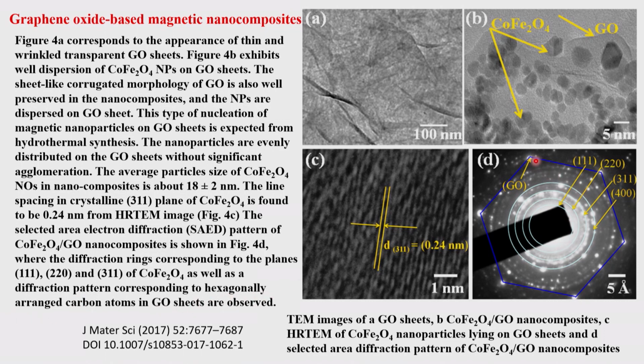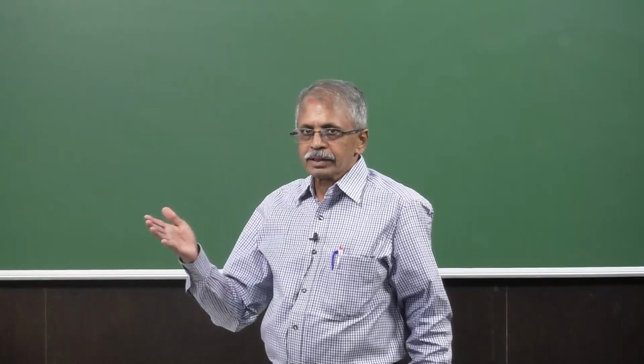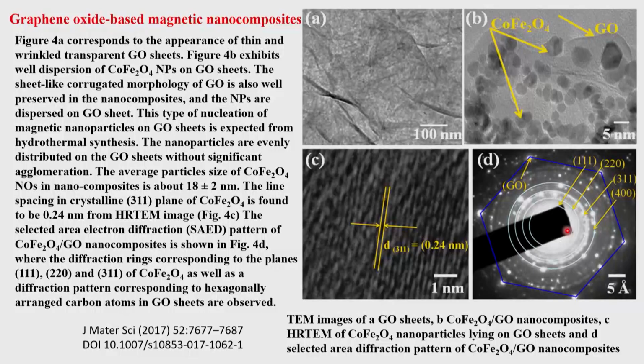You can see these carbon atoms here. This is from the graphene sheet. So this gives you a very characteristic means of approaching how to develop your material, how to modify your chemical components, how to modify the structural components, thereby electrical, magnetic, optical, all kinds of properties.